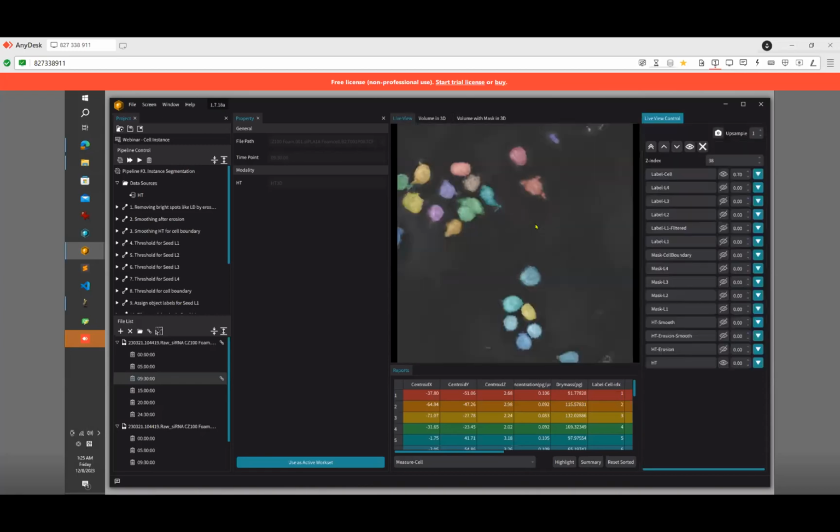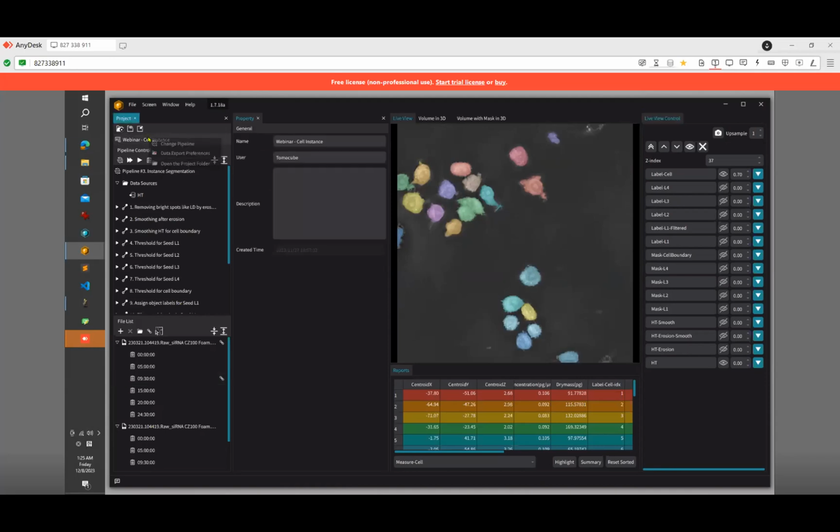So this is the basic idea of the cell segmentation, and it's all in 3D. As you see, you can browse up and down to see how the segmentation result changes along this direction. You can do the same thing in batch by pressing this double triangle button to process all the data, and you get the result in TIFF for the image data or the mask data, and the result data is saved in CSV, which can be loaded in the pipeline part.